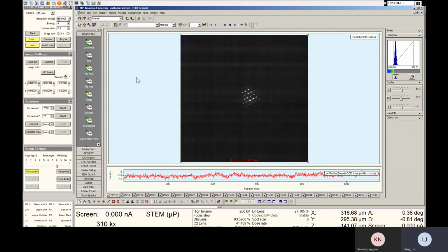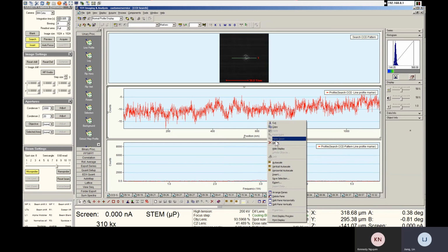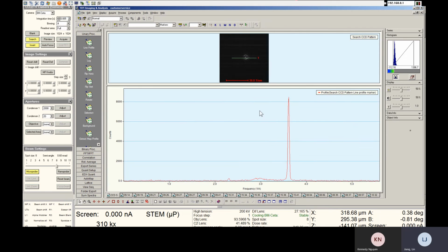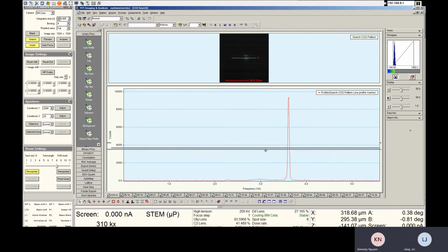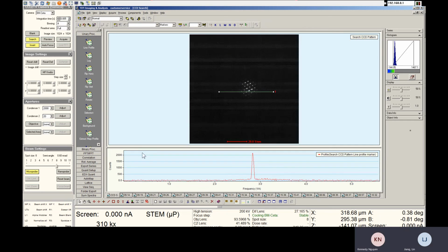You can go to profile. Delete this. The max count is 2,000.